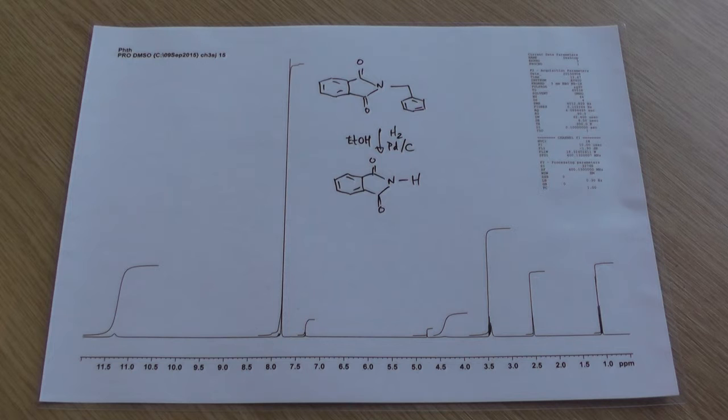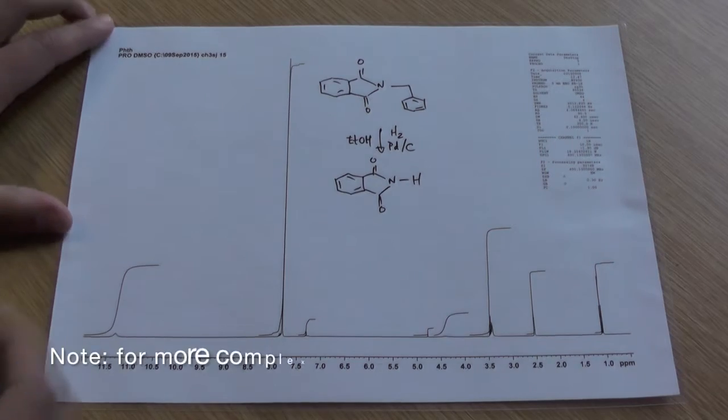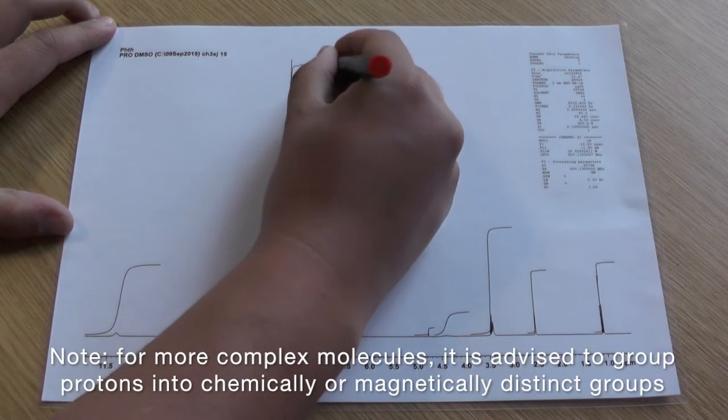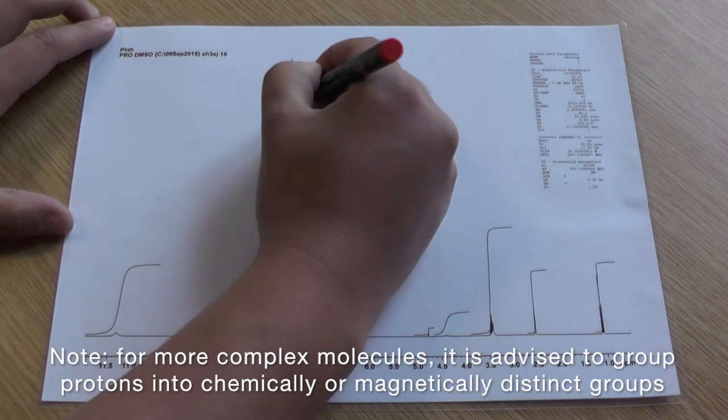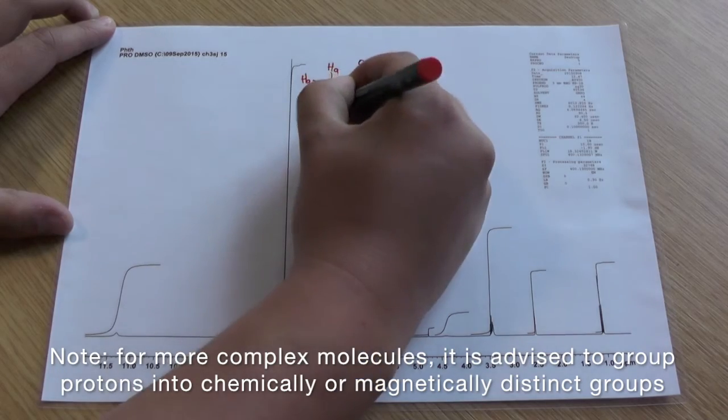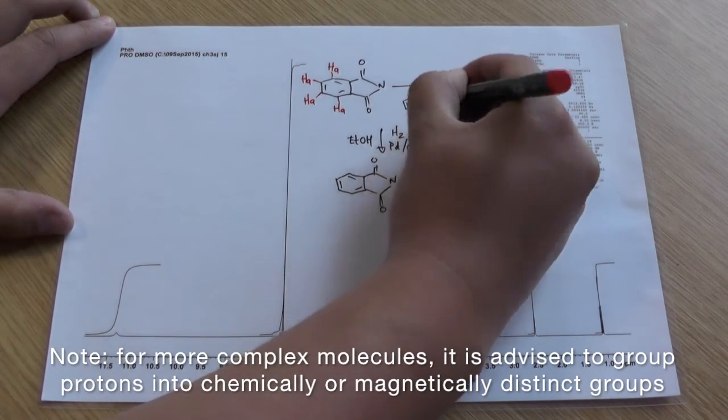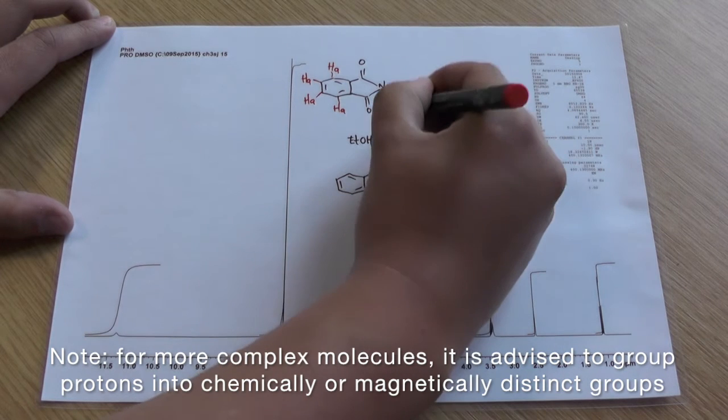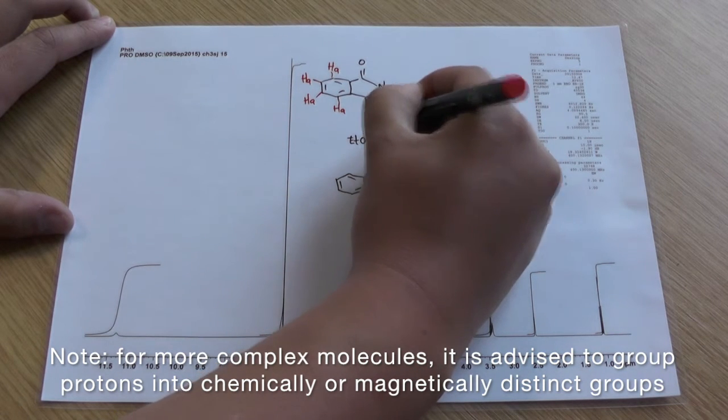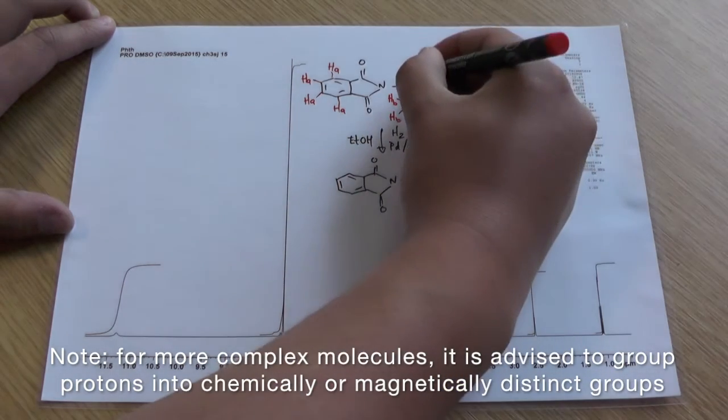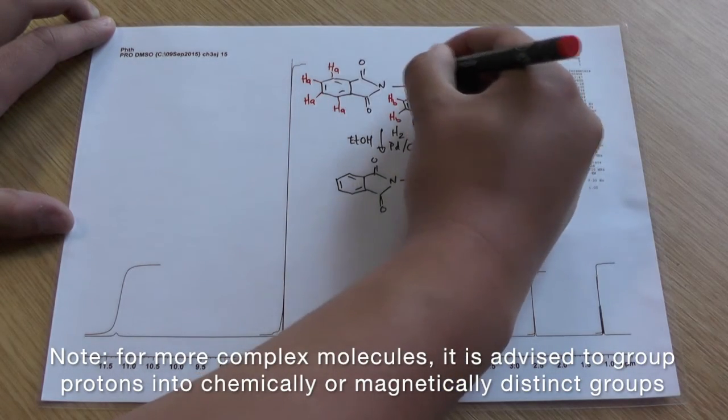The first thing you can do is look at your starting materials and products and think about what peaks you might expect to see. In your starting material you have four aromatic protons on the left hand side of the molecule, we are going to call these HA. Then you also have five aromatic protons on the right hand side of the molecule, we are going to call these Hb. And finally you have the two aliphatic protons which we are going to call Hc.